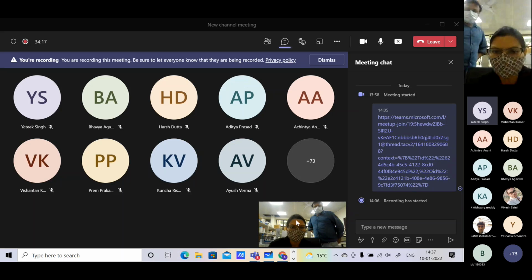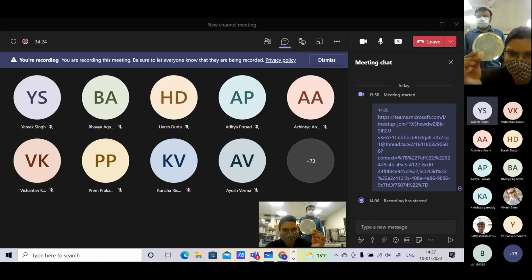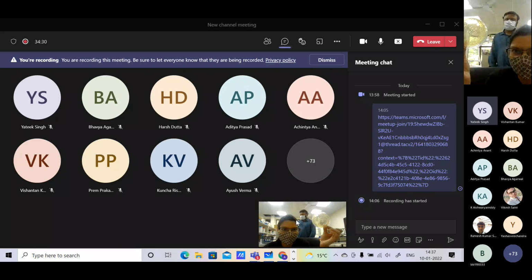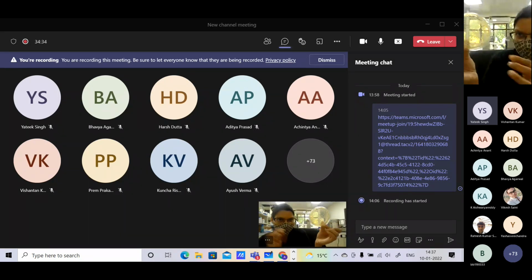Okay. So for the protein expression, now we have our host ready. We have transformed our cells and we get a plate like this, single cell making a single colony. Can you see the plate?